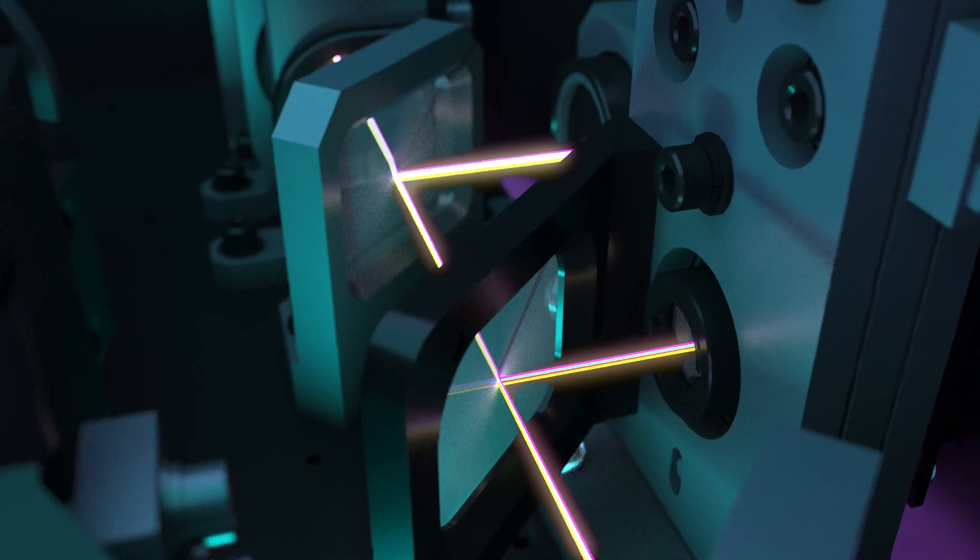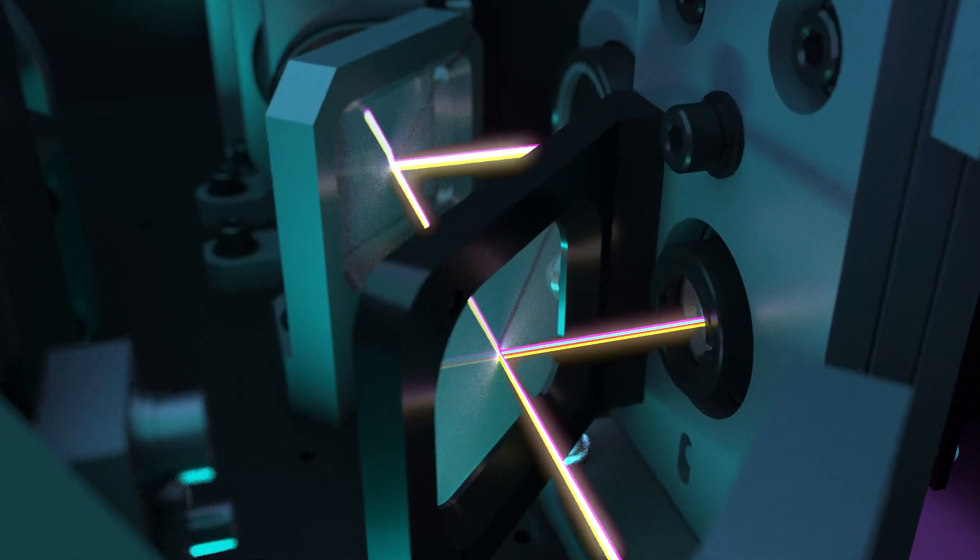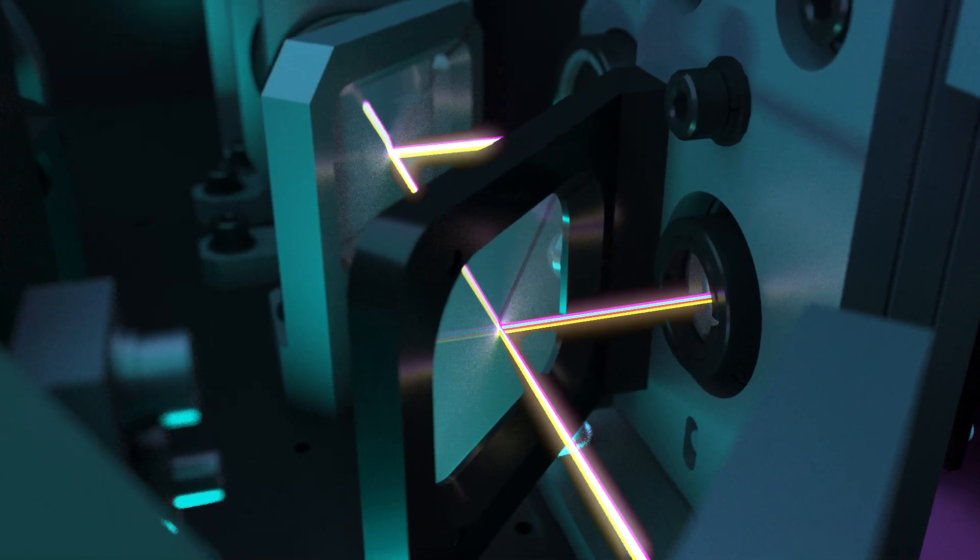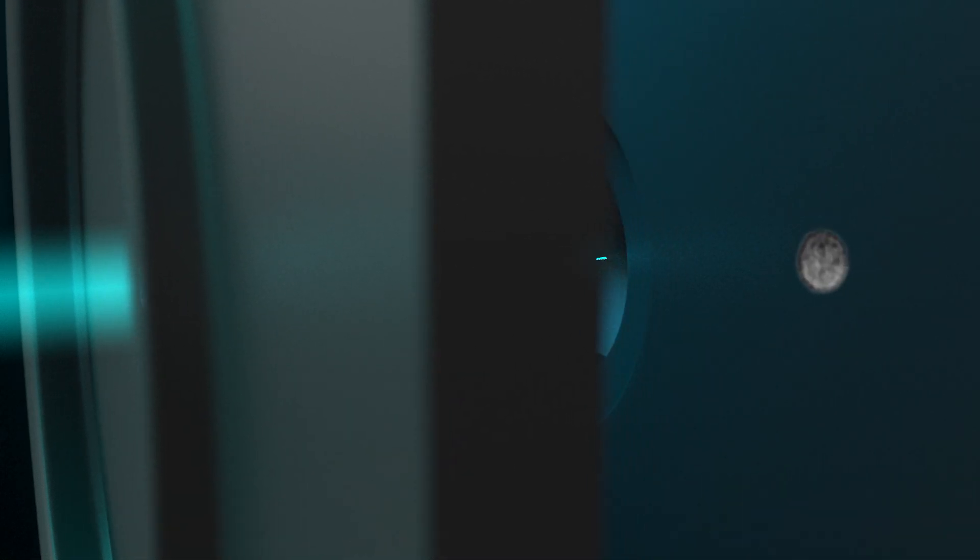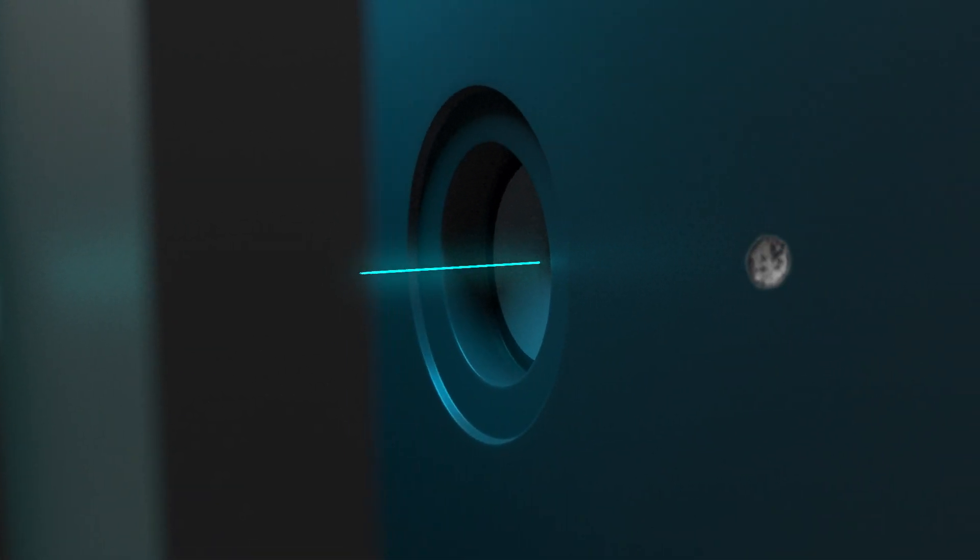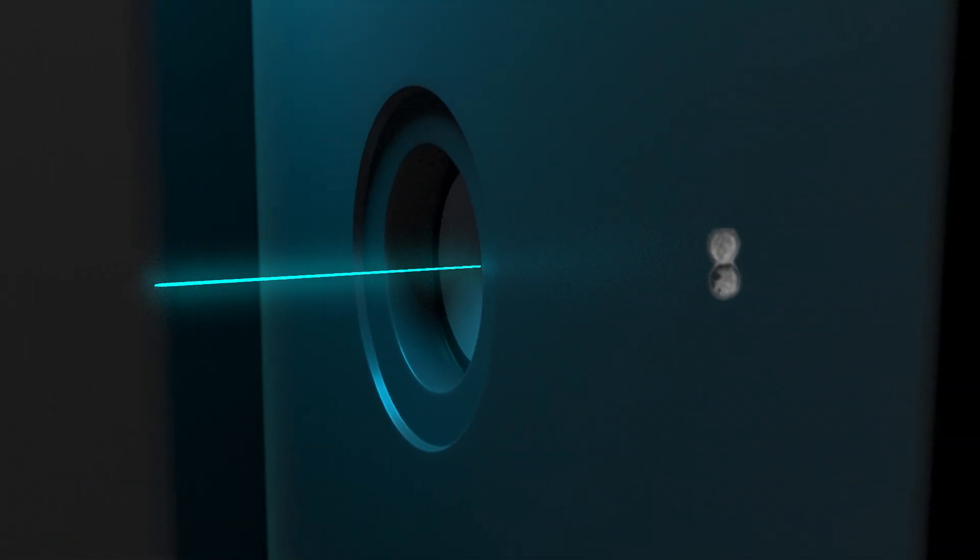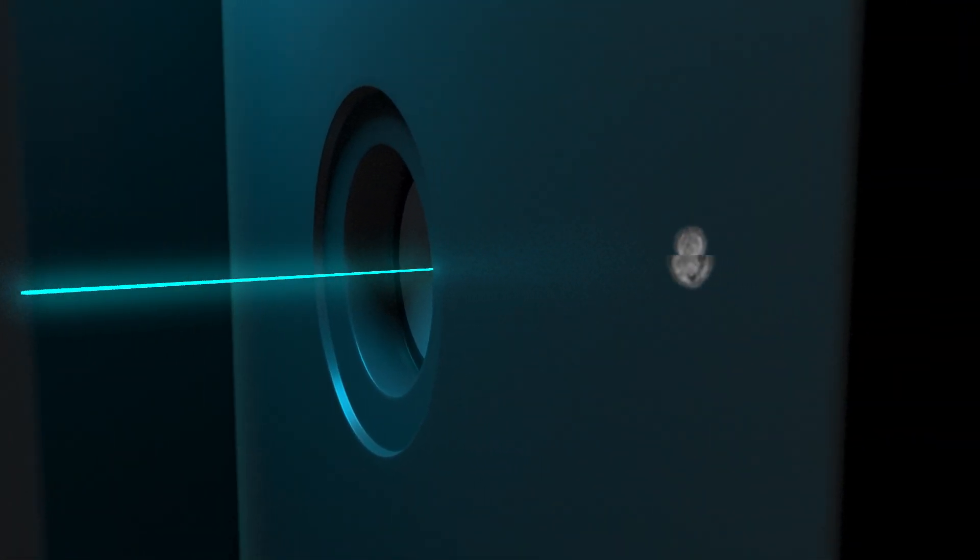In addition, a light loss detector collects the incident light as it passes through a pinhole to produce images similar to bright-field images collected on a standard microscope.